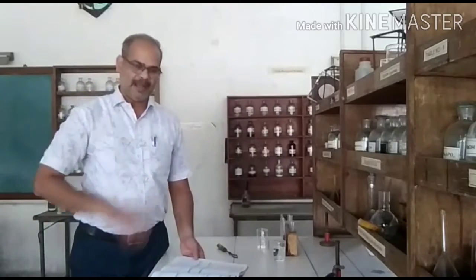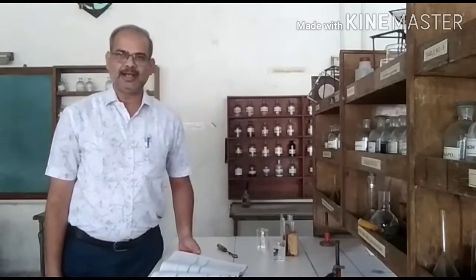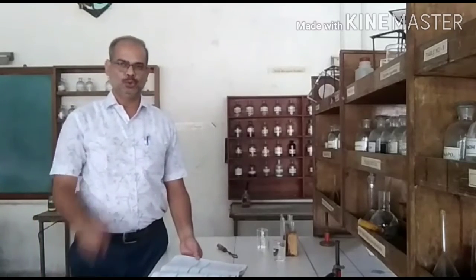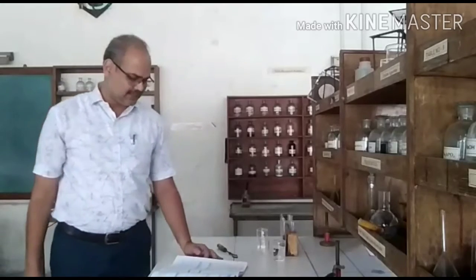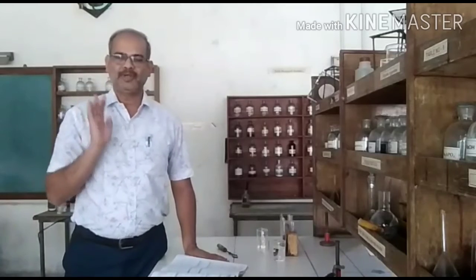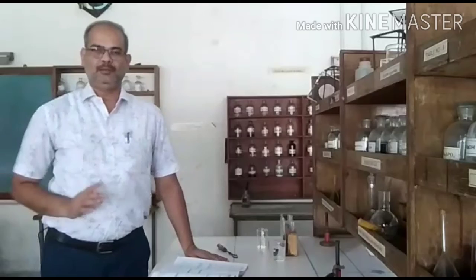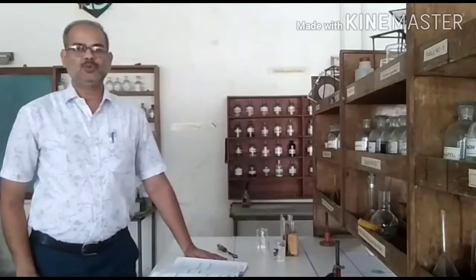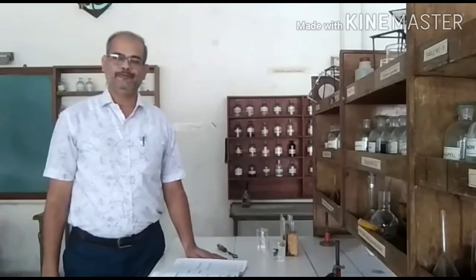Serial number 2, leave it blank. Number 2, CT for second detected acidic radical. What would you write there? Sulfate. In the bracket, SO4-2. You will write only one test. So what test you will write? OS plus lead acetate in the test column. In the observation, what you will write? White PPT obtained. This white PPT is insoluble in dilute HNO3, but it is soluble in hot ammonium acetate. This will be the observation, and the inference will be SO4-2 confirmed.